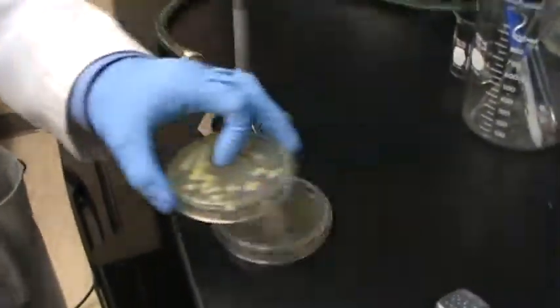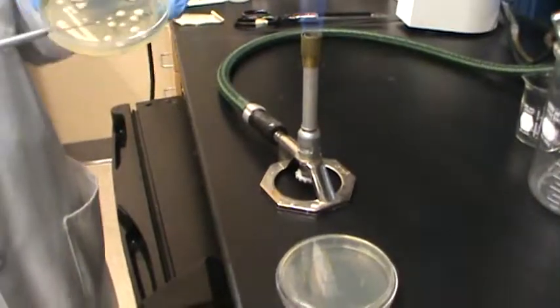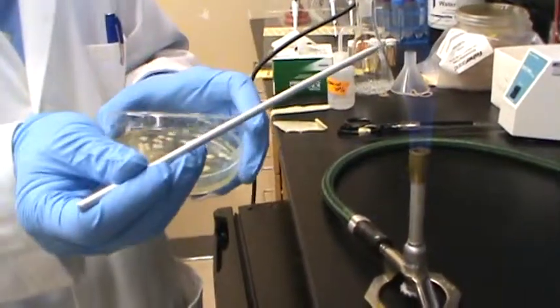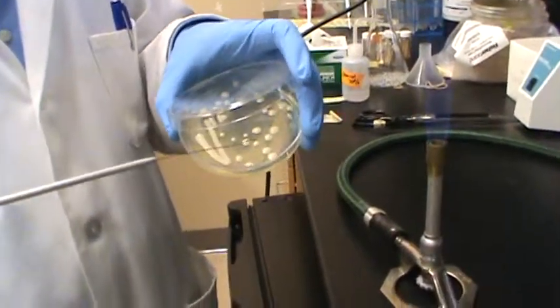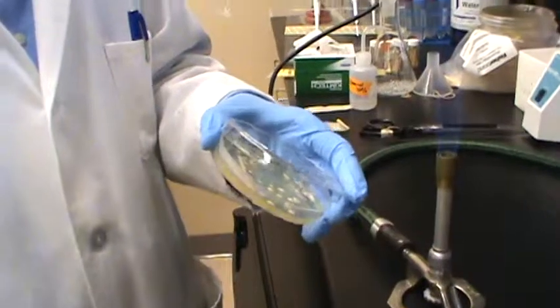Before we do that, we want to make sure the loop is actually cool. Touch the side of the plate to make sure it's cool. Then take one single colony, let's say this one. That's actually a lot of cells.